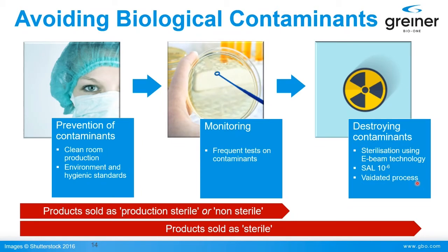The idea is never to produce something that may be a little bit contaminated and clean it afterwards. The idea is to avoid contaminants, and this is state of the art and good practice in manufacturing today. And this of course only goes together if a monitoring step is also carried out with a certain frequency, several times per year, where you say, okay, I did my prevention of contaminants and monitored my clean room, but I also need to show that all this is effective.